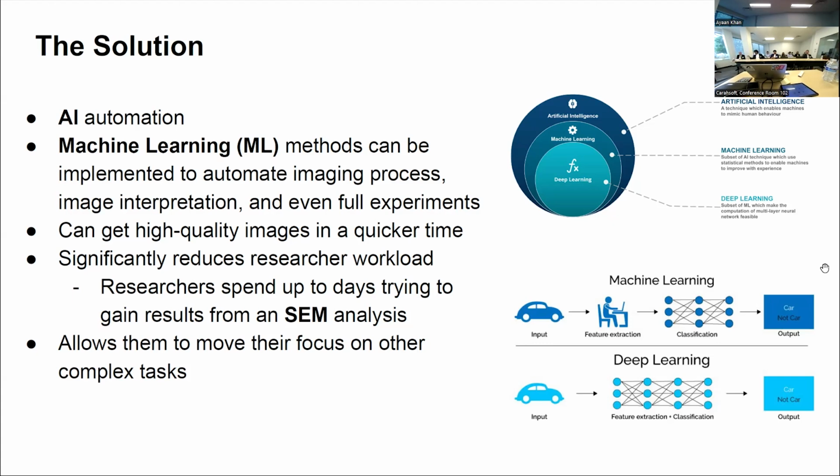As I said before, researchers spend up to days just trying to gain usable results from one SEM analysis. So AI automation will allow them to move their focus onto other complex tasks, while this will be essentially running in the background.